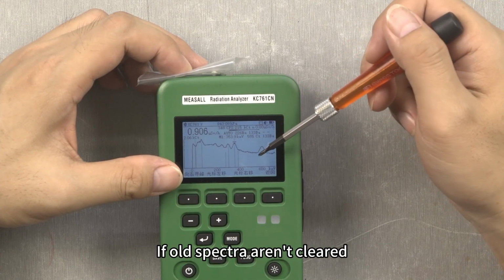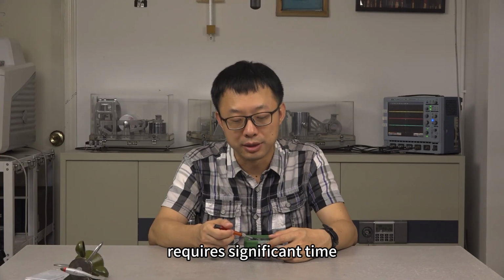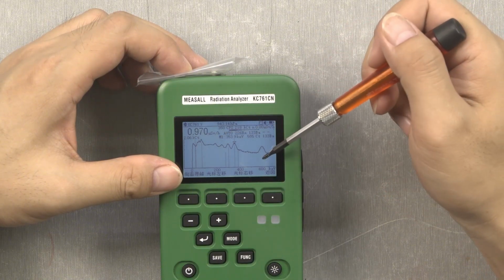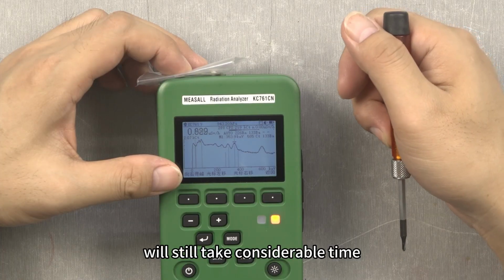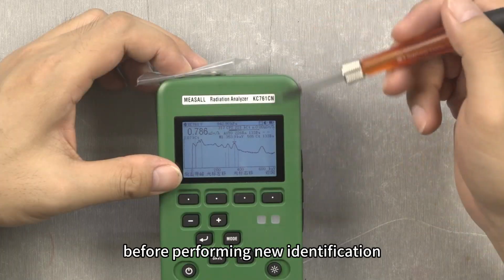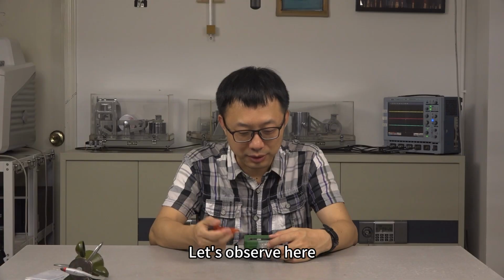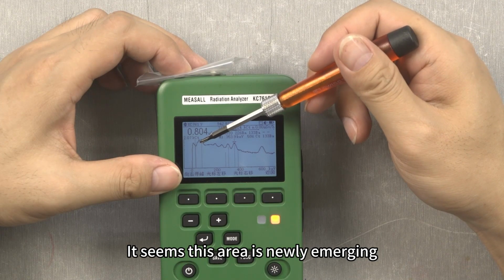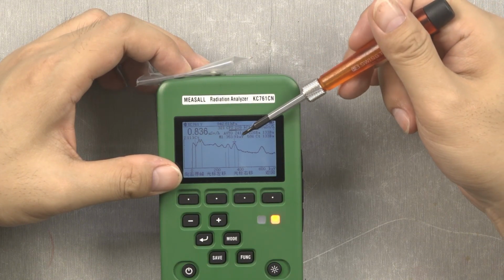Default spectra are uncleared. Adding a new one with over 300 CPS count rate requires significant time to extract characteristic peaks. To make the characteristic peaks stand out will still take considerable time. Therefore, it's best to clear the spectrum before performing new identification. Let's observe here how long it takes to identify without clearing. It seems this area is newly emerging. As a distinct feature, this part is becoming quite prominent.